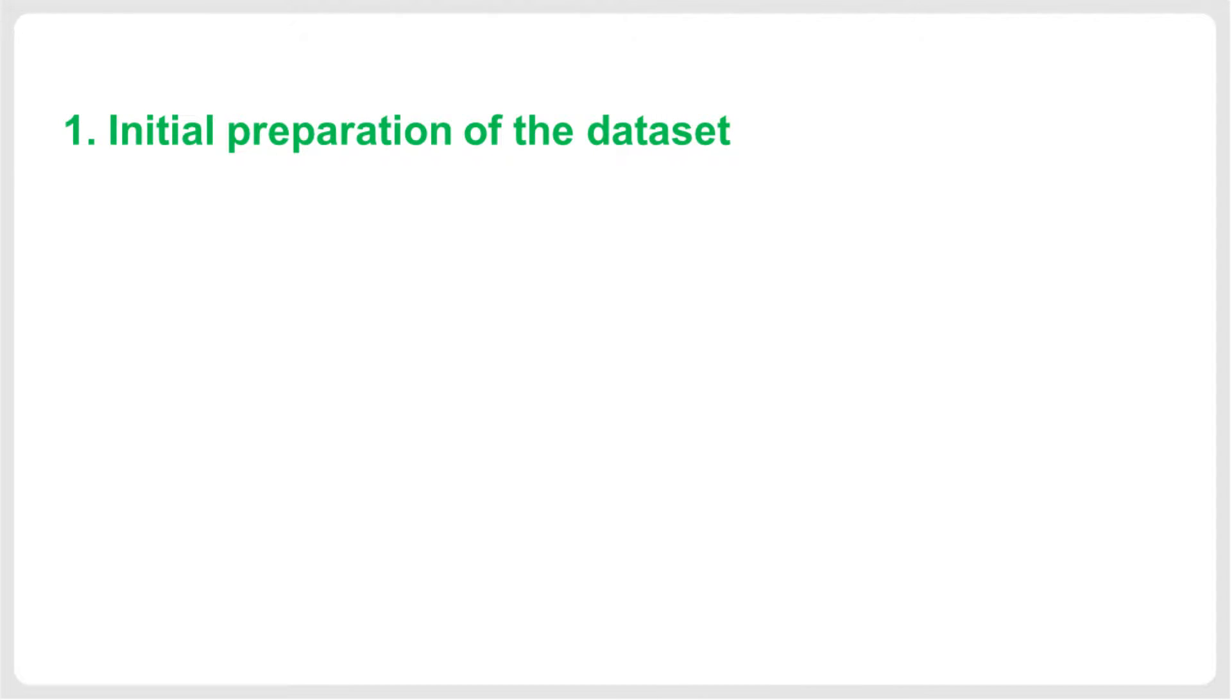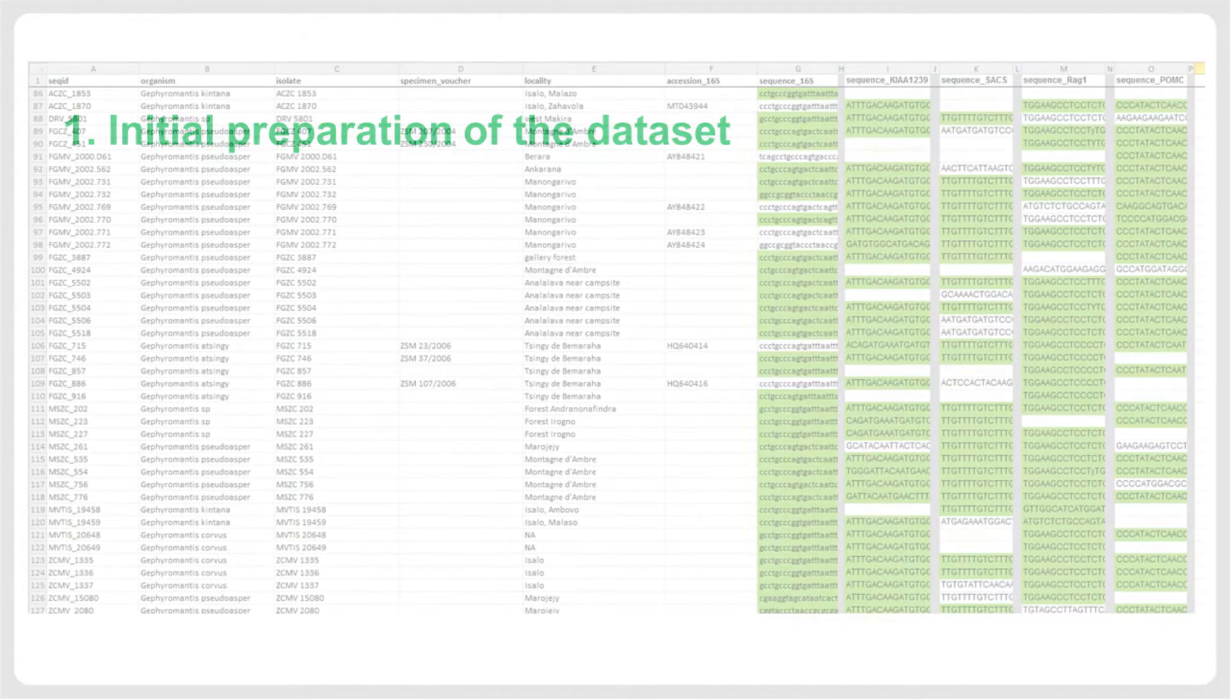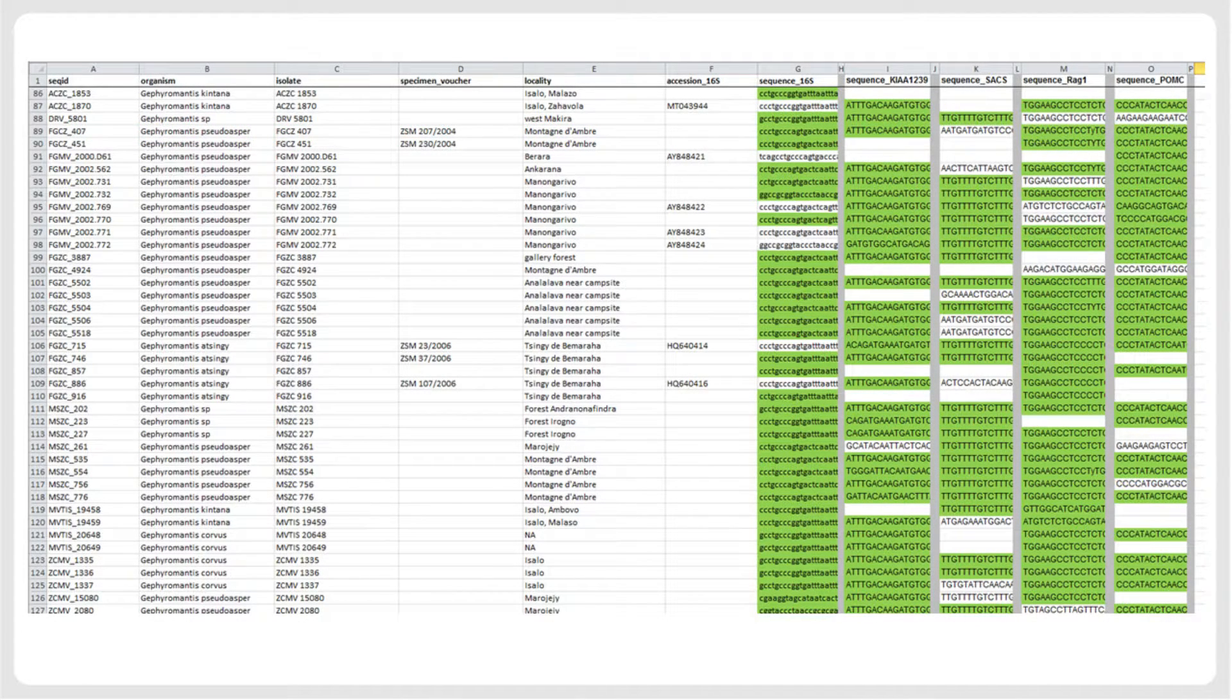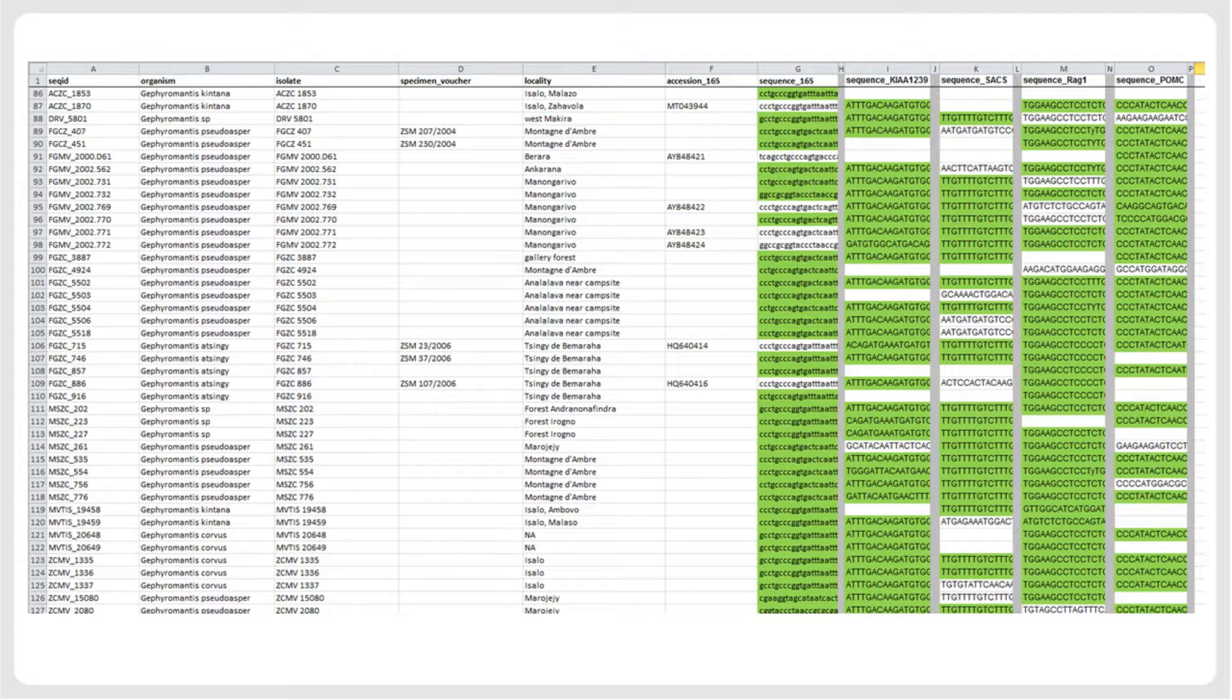The first step of the sequence submission procedure is to prepare all data locally and offline, converting them into the appropriate format for submission. In the following, we will explain, using a real example from our own research, how spreadsheet-organized sequences can be easily submitted to GenBank. Besides explaining the specific formatting of the input data, we will also illustrate step-by-step the process of submission to GenBank.